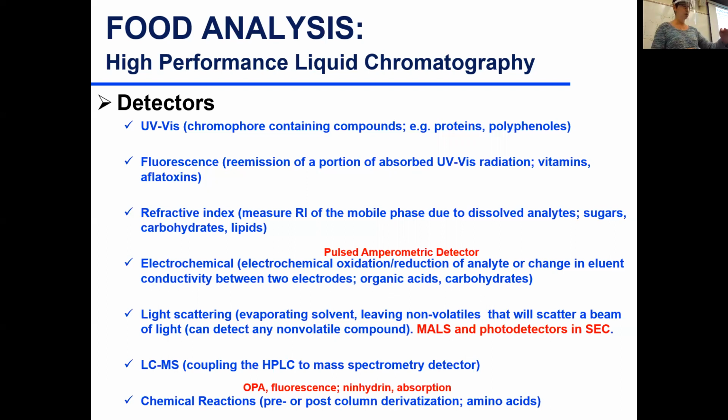The atom or the molecule goes from ground state to excited state, so an electron jumps from one shell to a higher shell. But then it doesn't stay there. It gains energy and then it needs to relax and go down to its ground state. While it's doing that, some compounds actually fluoresce. That means they emit light that you can measure.